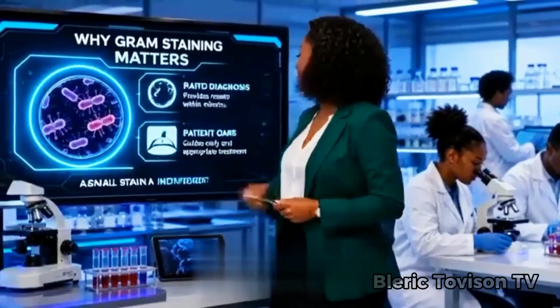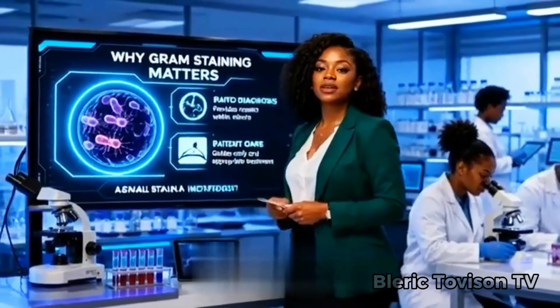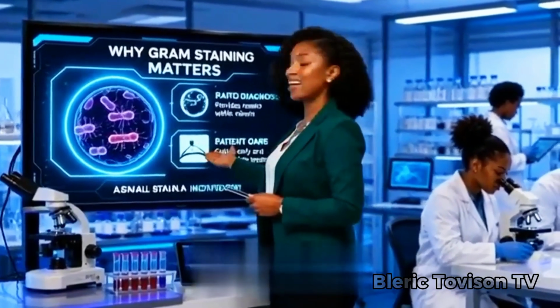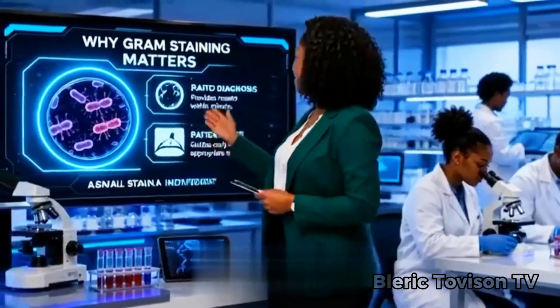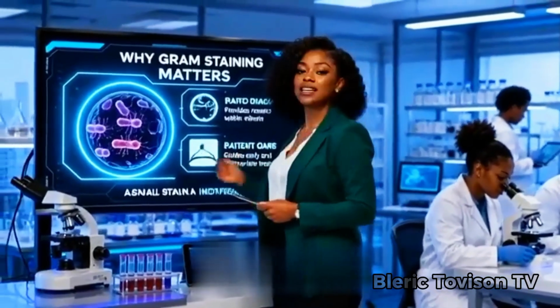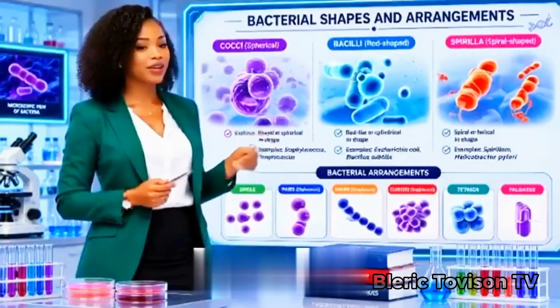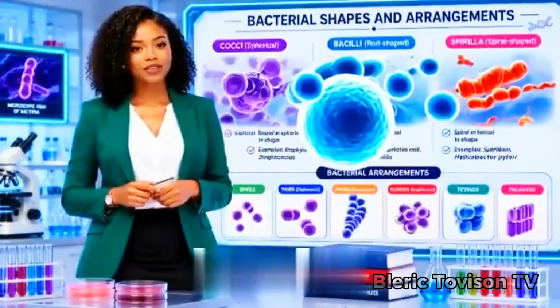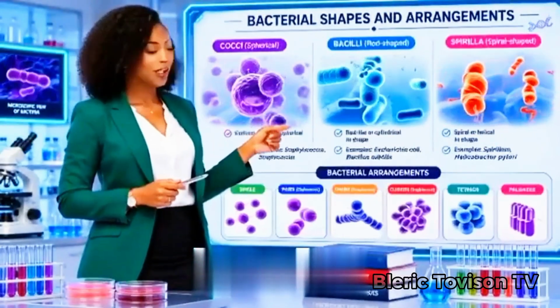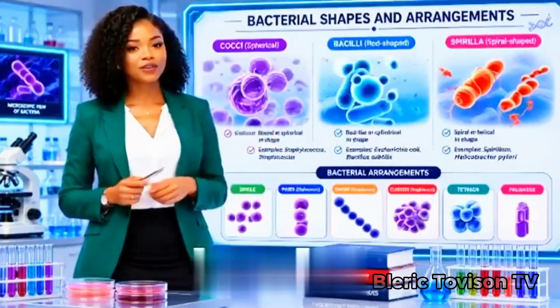Every day, hospitals around the world use gram staining as one of the first laboratory tests. Within minutes, it helps identify whether bacteria are present and provides essential information that supports early treatment while more detailed tests are still in progress. A gram stain reveals much more than the presence of bacteria. It shows whether they are gram-positive or gram-negative, their shape, and even how they are arranged. These details help microbiologists narrow down the identity of the organism.